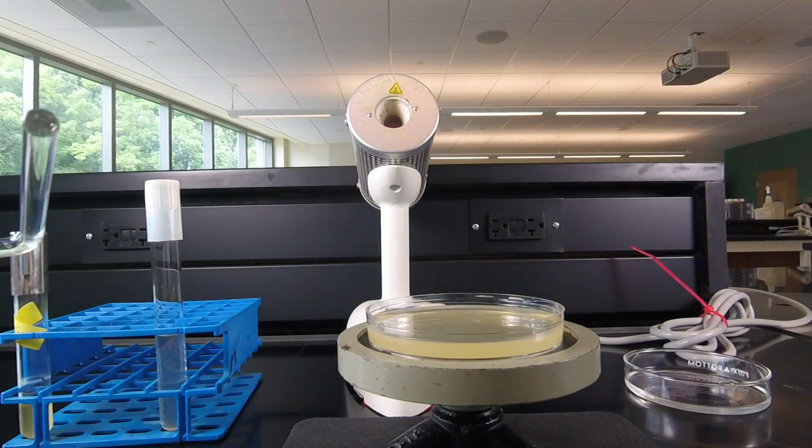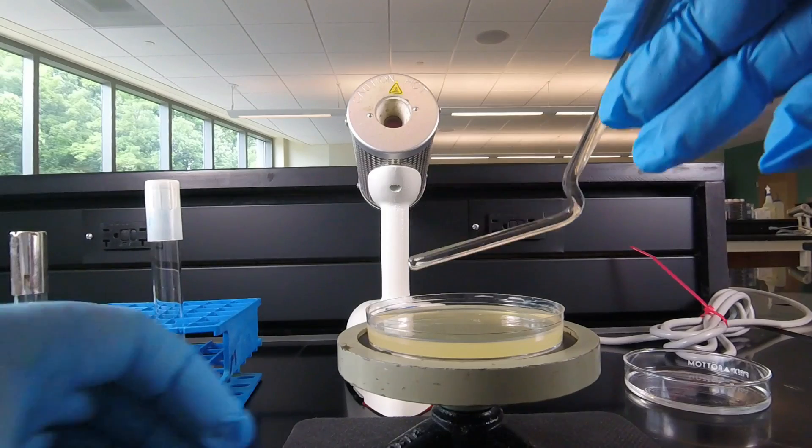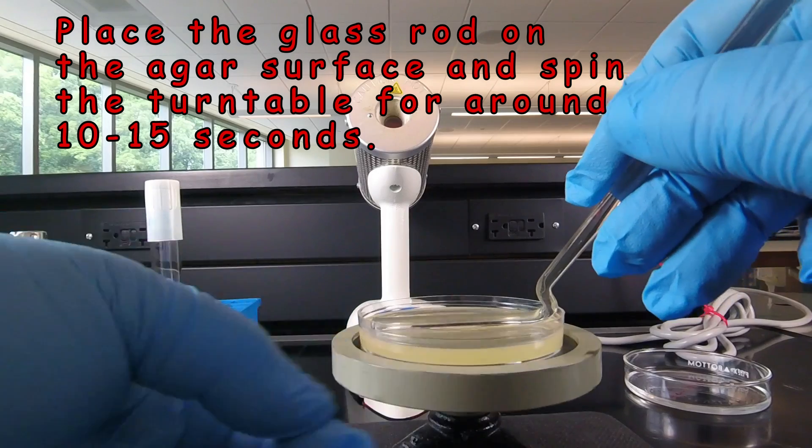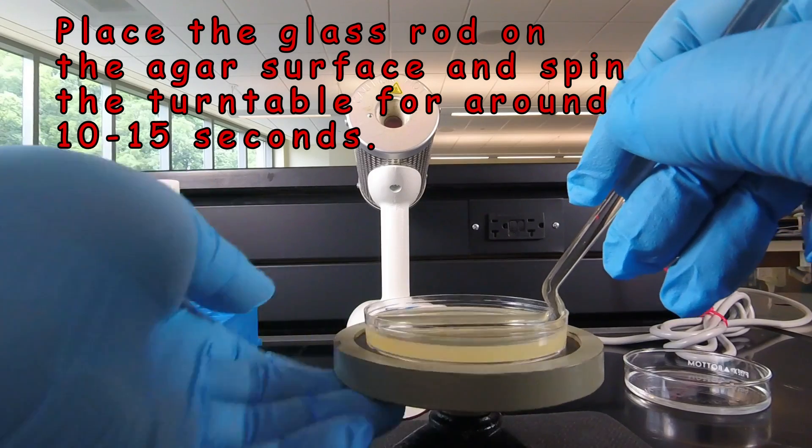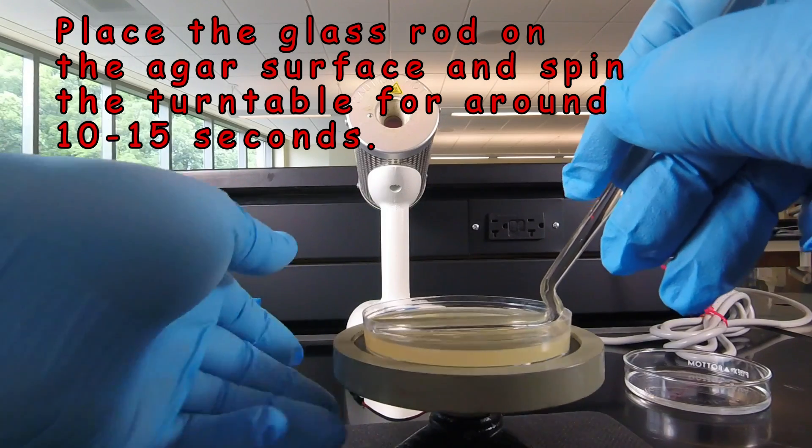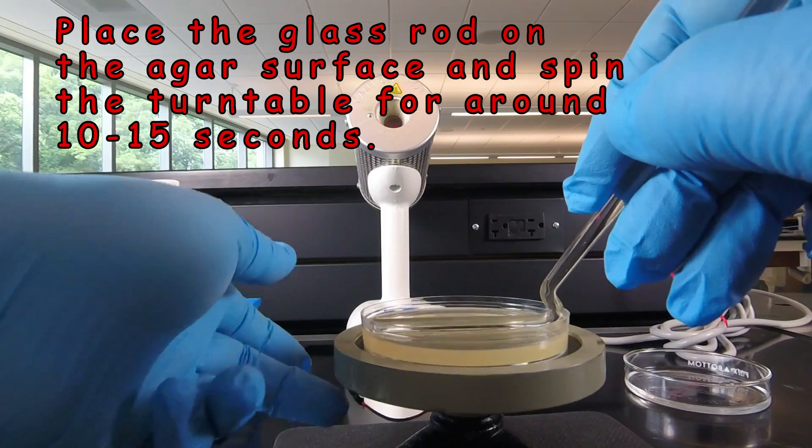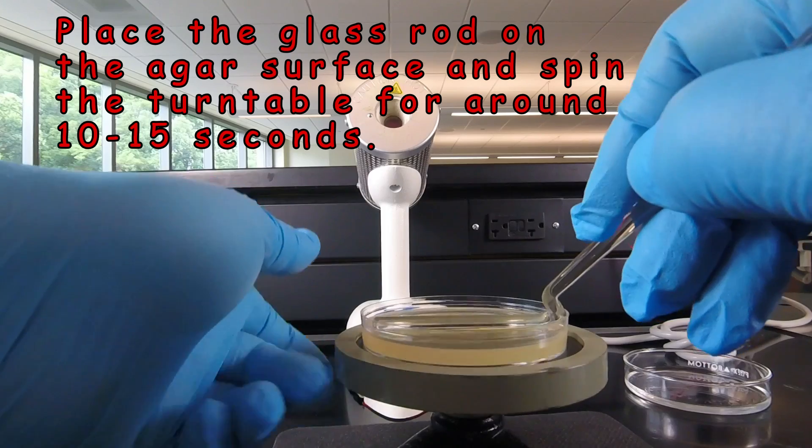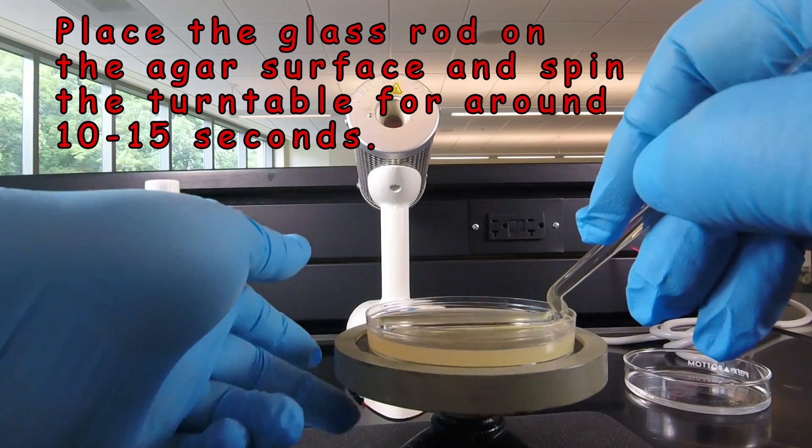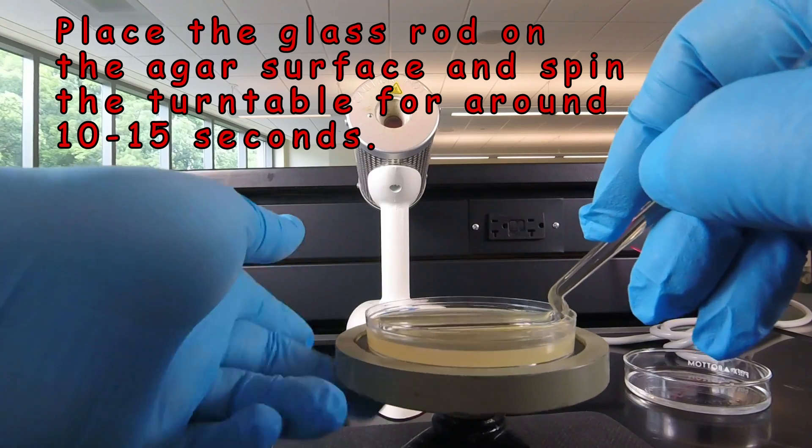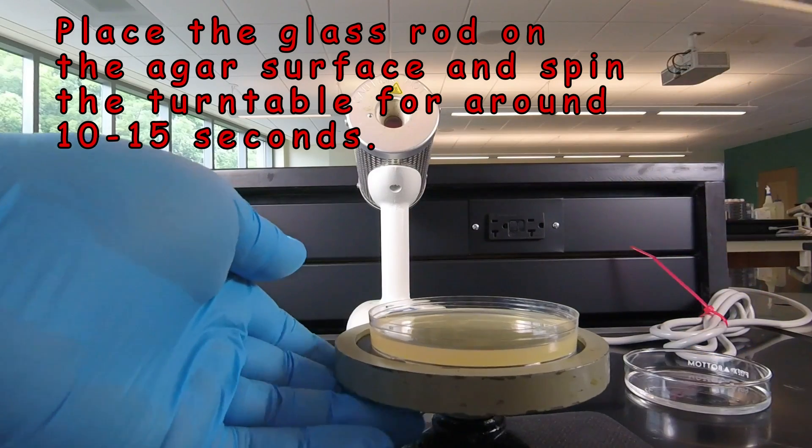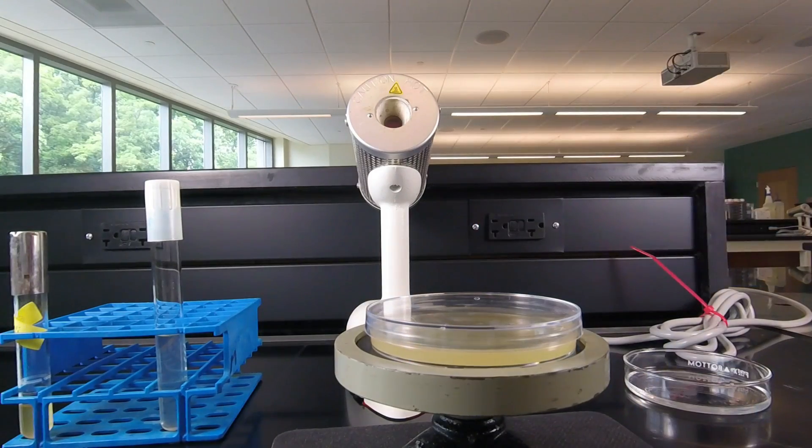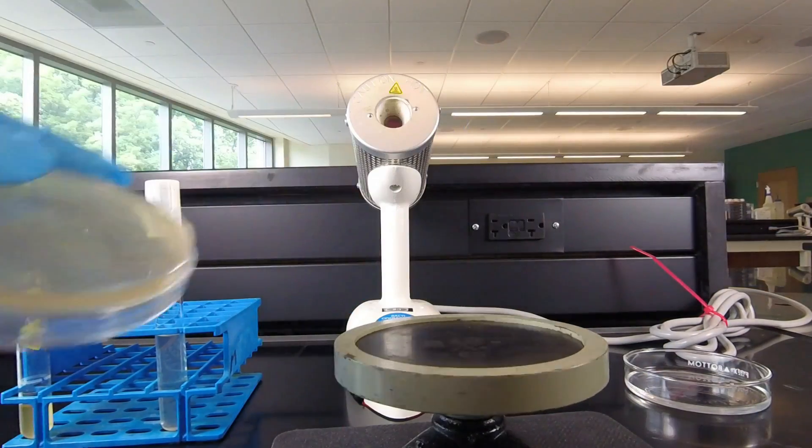Once again we do have to remove the lid. We're going to set this flat on the agar surface and then we're going to start spinning the turntable for maybe 10 to 15 seconds. After which time the bacteria are spread out pretty well we're going to put the cap back on the petri plate. And then that can be incubated.